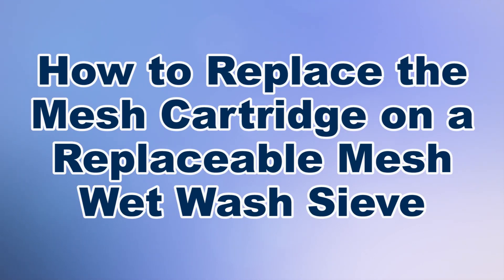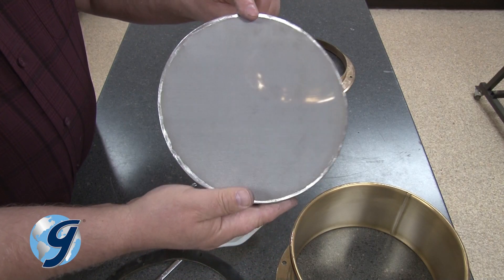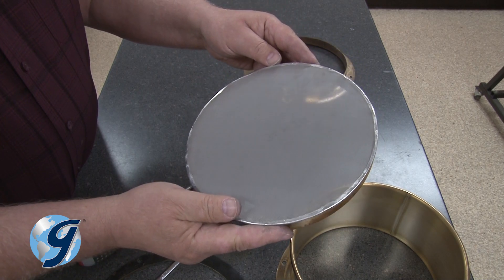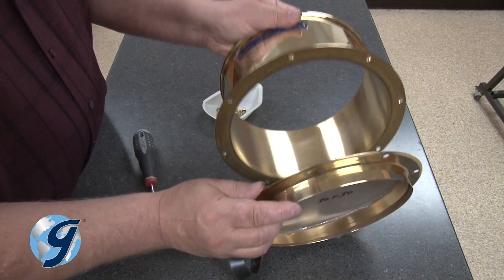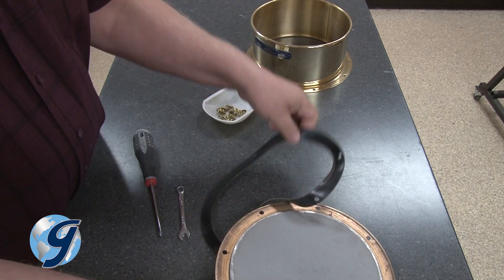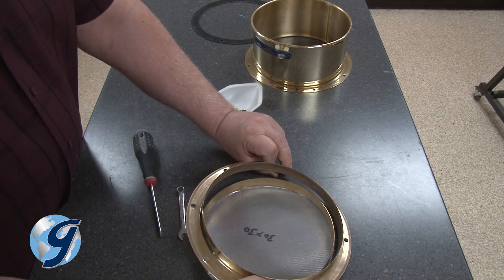Gilson's replaceable mesh wet wash sieves have a unique replaceable mesh cartridge that combines ASTM E11 compliance grade stainless steel wire cloth with a sturdy stainless steel backup cloth for a long service life. The cartridge is designed for easy replacement. These interchangeable cartridges can be replaced quickly when the mesh is worn beyond acceptable limits, thereby saving considerable expense over purchasing a new ASTM wet wash test sieve.